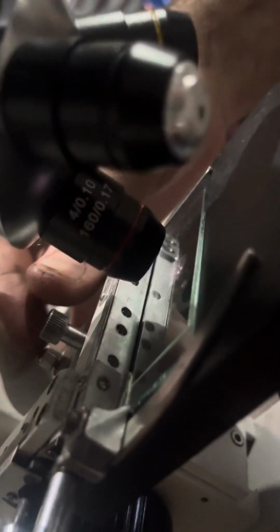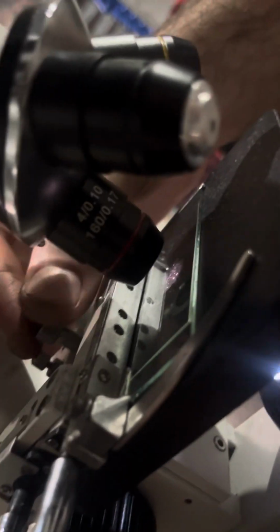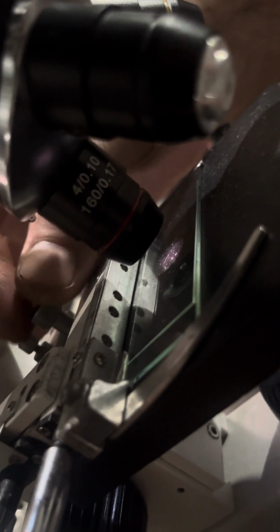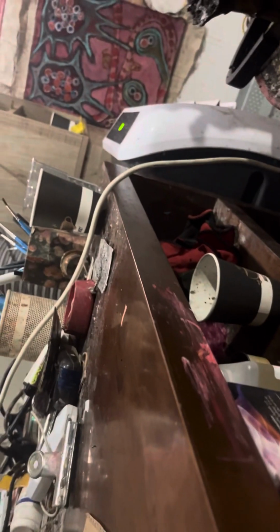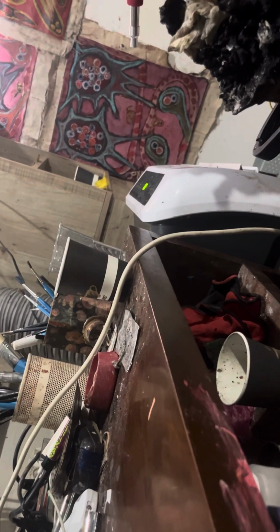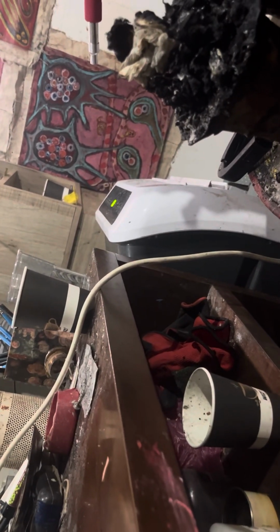So the microscope is not calibrated. Give me a second, I need to use the screws here. Okay, better now. Excellent, nice. I use non-standard covers that are big. I like to use a lot of material. The cover is not the regular square, but it covers almost all the slide.